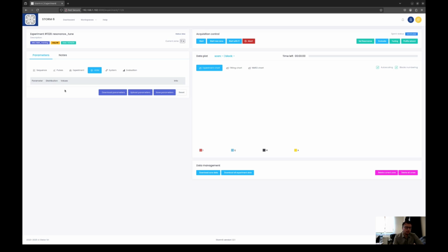So these blocks can be linearly distributed, logarithmically distributed, or we can also write a list of the tau. So this basically is the distribution of tau. This is a single block. In this experiment, this part is basically empty, but in other experiments which we will do later, like NPS, we will see how we use this part and how we tune it.